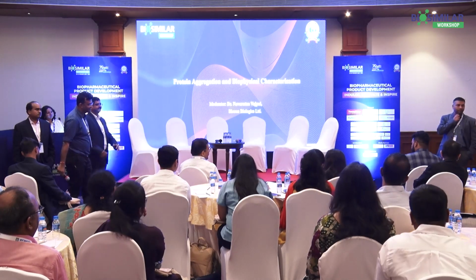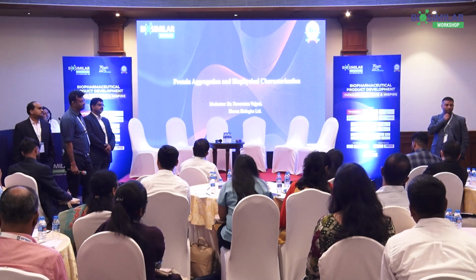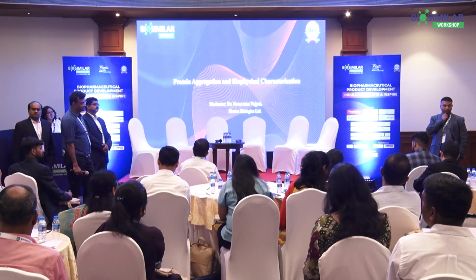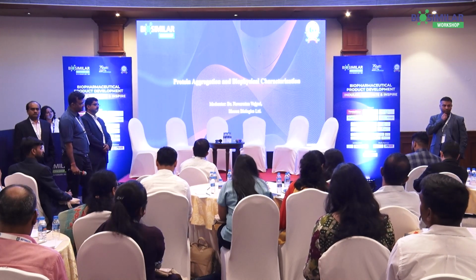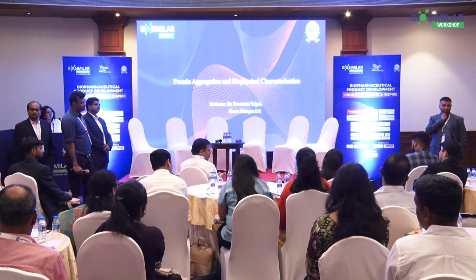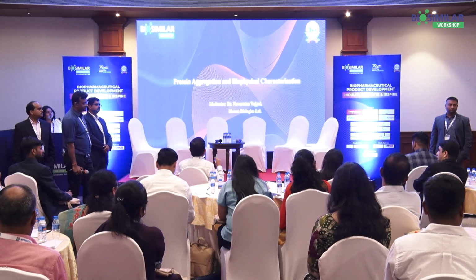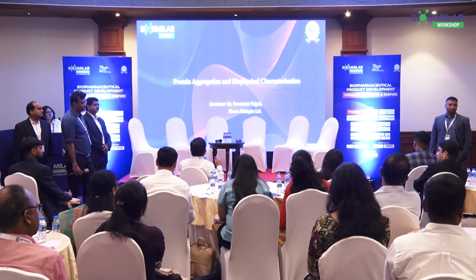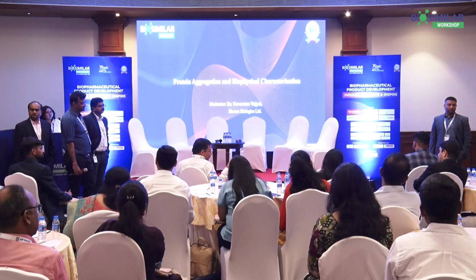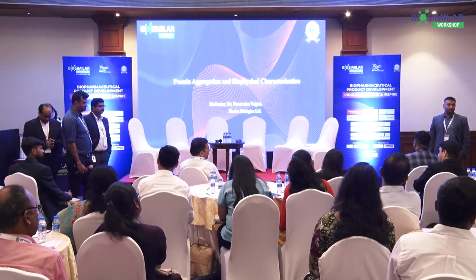I agree with you, because it is mostly observed that proteins are stable at higher concentrations. When you are diluting, you are also changing the buffer, because your formulation excipients may not be compatible with the CD. So you have very limited choices like PB and all those things. So you don't know what is happening when you are diluting. I understand the way you have demonstrated the linearity. Basically, that is one aspect where we can optimize the concentration. But it is difficult to ensure that whatever we are reporting is the true representation of the sample. And I understand this is a limitation.